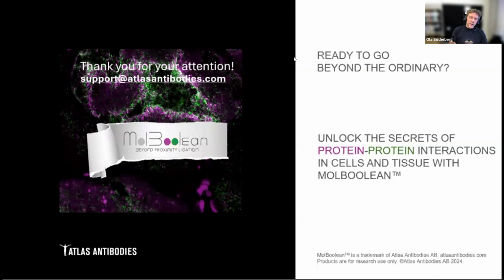I think it's always a bit of a problem. We talked about that before: how big a proportion of the protein pool do you bind with an antibody? Say that you bind 30% with each antibody. If you look at the interaction between 2, you have 30% times 30%, so you're down to 10%. And with 3 proteins, it's 30 times 30 times 30, so you're down to 3%. So it's of course more difficult to target larger protein complexes, and also the oligos have to reach everyone. It's more complicated. It's not an easy task.